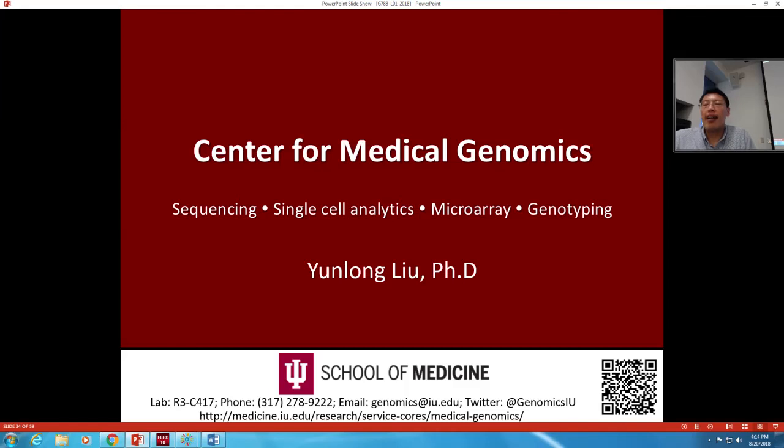So basically, what I want to deliver here is that none of those sequencers are a magic box that you send your samples into and something will happen and then you'll get a sequence. They are all based on real biochemistry principles and reactions. I think if you're innovative enough, there may be something to be improved on top of it as well. I know many companies are working on long range sequencing. So far, most of the accurate ones are still short range, but I think that will soon come along.